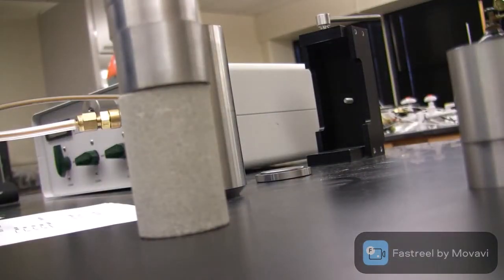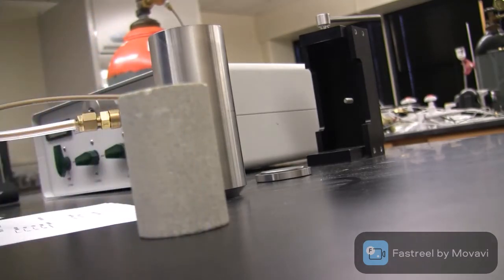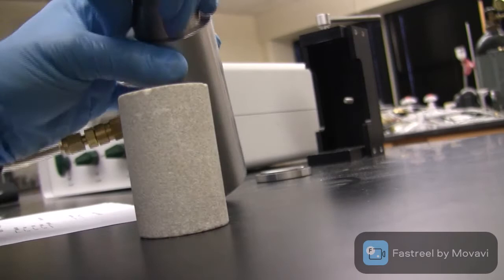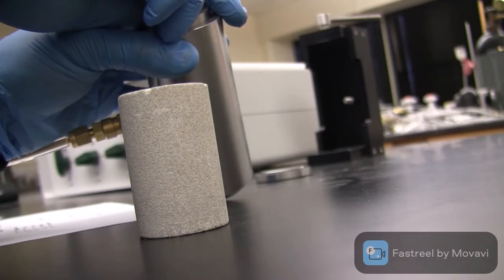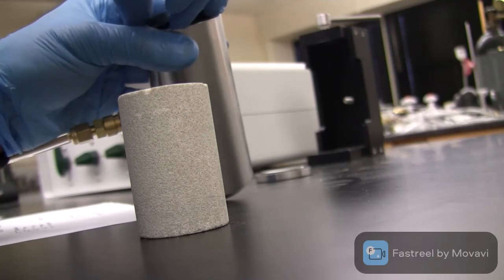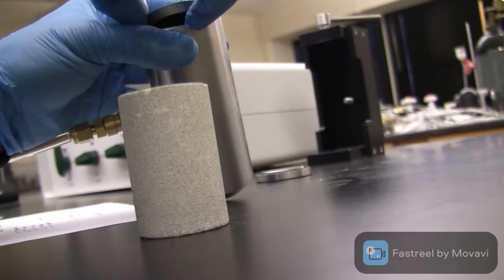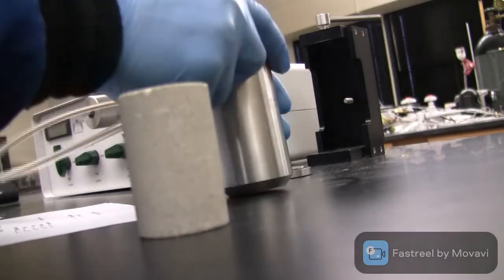So you record the ones that you remember, C and E. After that, we take the extra pellets and put them inside your chamber. Or actually, it should be slightly taller, not slightly shorter.